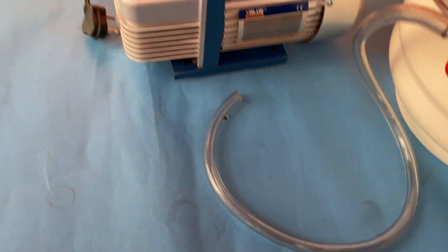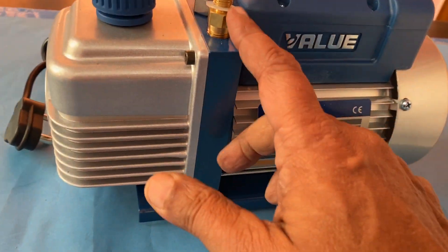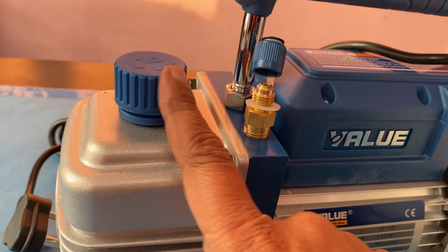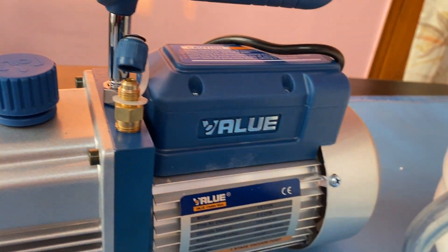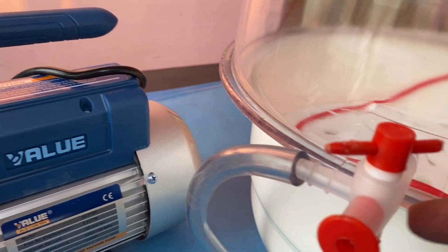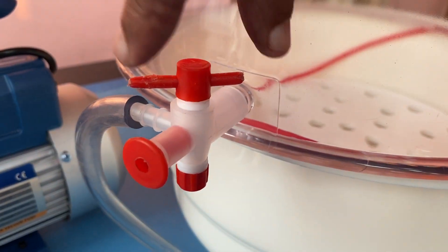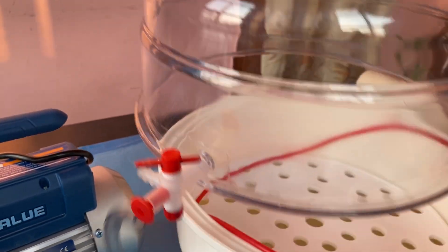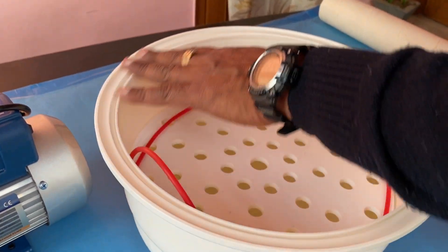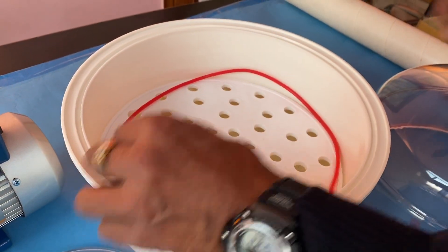This is a vacuum pump with a nozzle for sucking. This is a 220-volt pump. The first stopcock is for attaching to this section, and there is one gasket — put the silicon grease here.